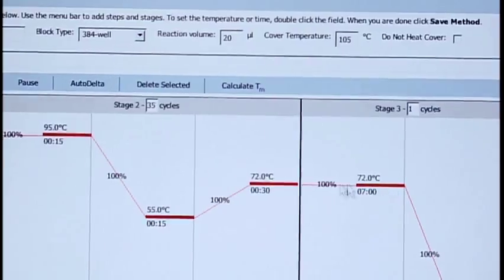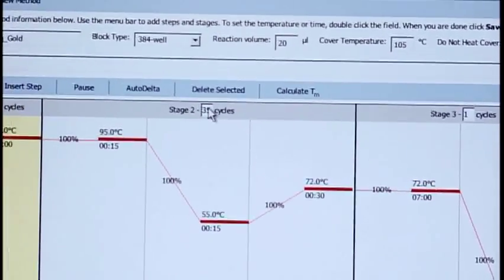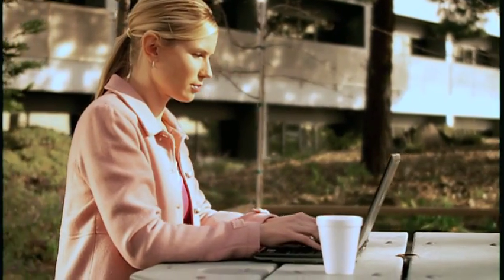And with VerityLink remote management software, you can access your Verity Thermal Cyclers anywhere and everywhere you go and automatically receive real-time updates on any email-enabled device.